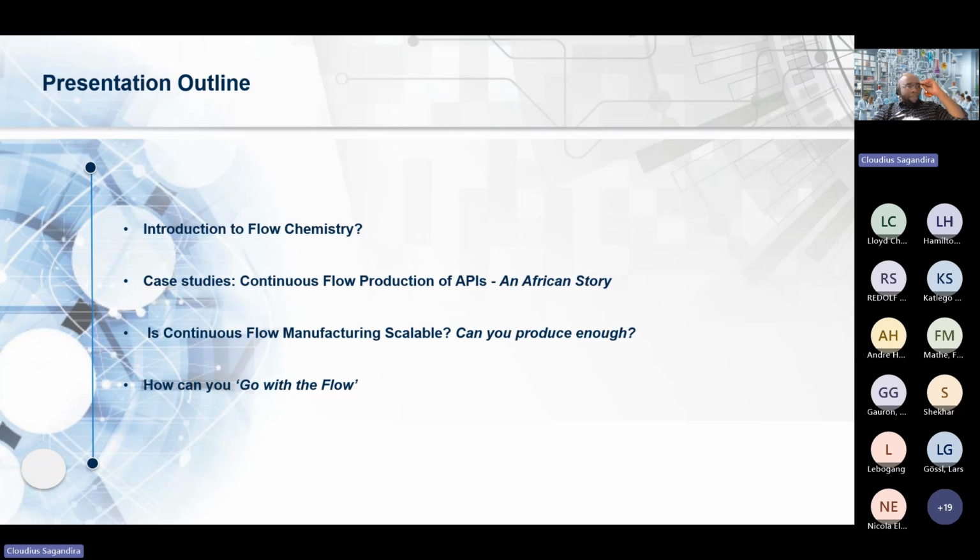So let's get started. I'm going to start with an introduction to flow, because of the audience that I have. Probably most of the people are not very familiar with the subject, and I will get into case studies, mainly focusing on the African story. I always like to talk about what we are doing in Africa here. And the biggest question we always get asked is, how can you produce more? Is this technology scalable? So we're just going to talk about scalability of this technology, just a brief introduction to it. Then the last slide will be on how one can set up a flow lab, a cheap flow lab, or a cost-effective flow lab in academic settings. So that will be the last one.